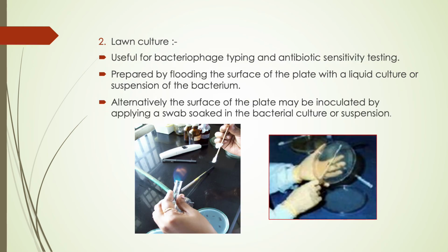Okay, the second method is lawn culture. What is lawn culture and why do we need to use it? Lawn culture is used to test antibiotic sensitivity, the activity of the antibiotics. For this purpose, what do we need?